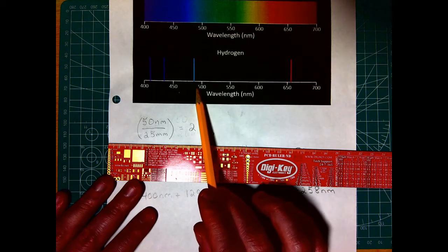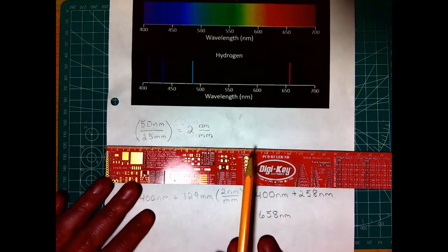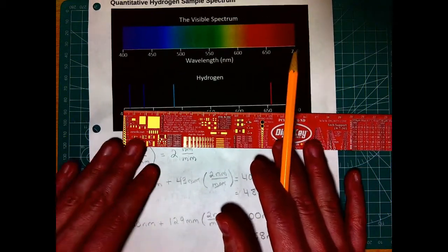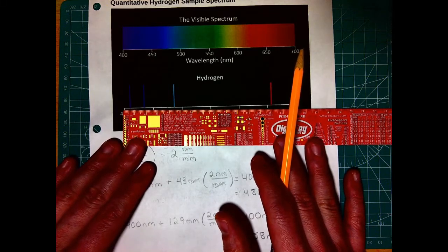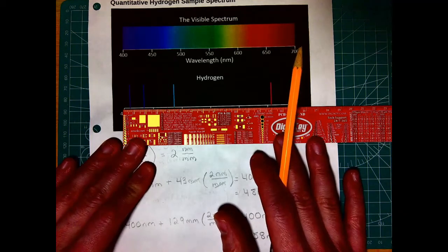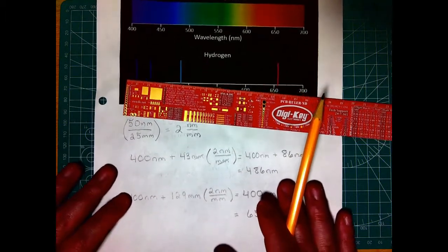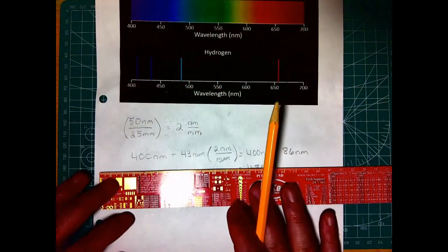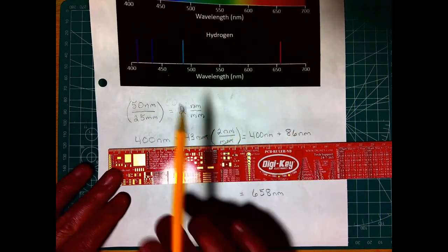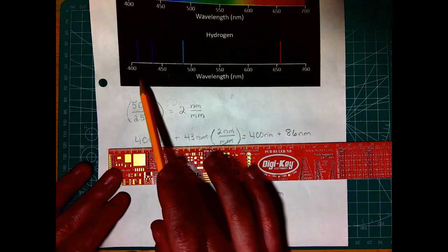If we want to know the wavelength of this middle blue line right here, we can figure out what that distance is by putting our ruler down here. I'm going to say that that is right about 43 millimeters. Now we do have one thing that's a little different from our map example here, and that is that we started off at 400 nanometers, so we need to add this in.